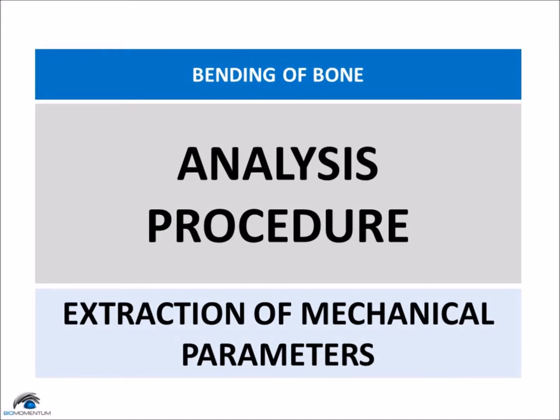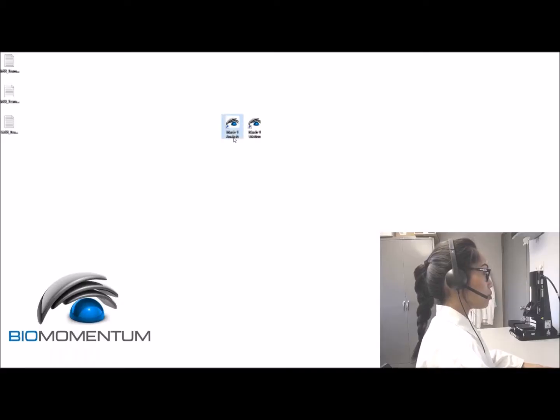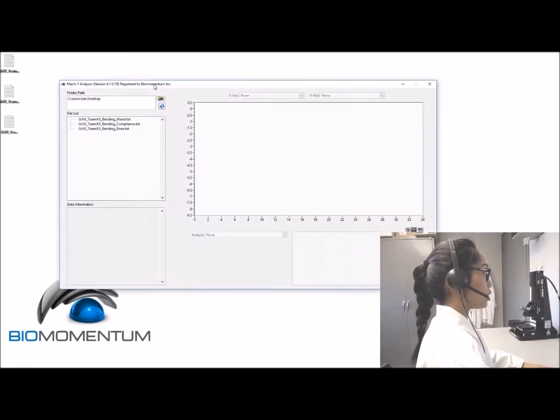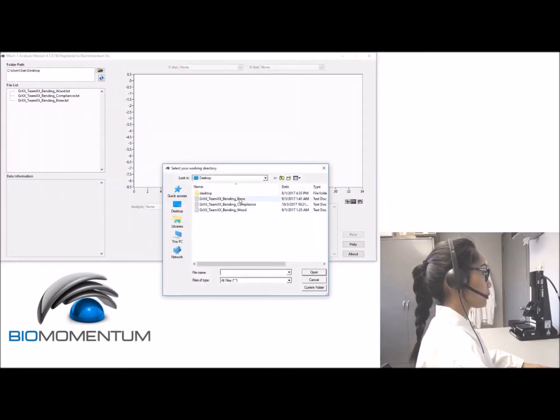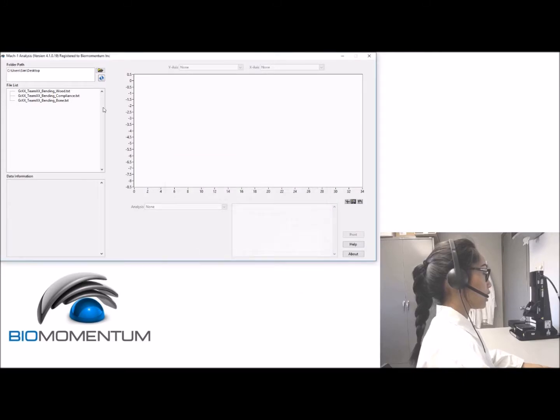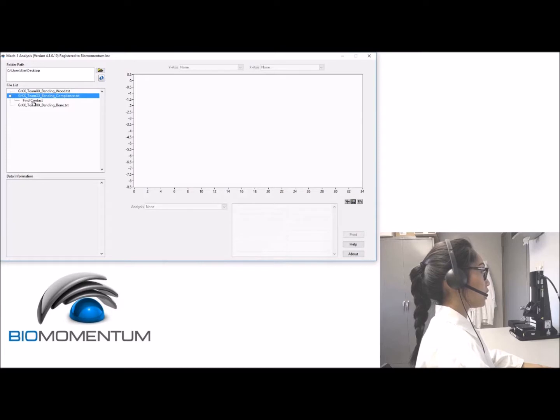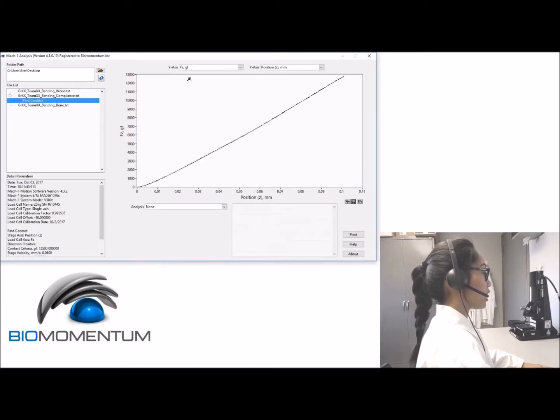Open Mach-1 Analysis and open the folder path containing the result files. Now let's analyze the setup compliance: click on 'Find Contact' and choose the force in the Z-direction as the vertical axis and position Z as the horizontal axis.